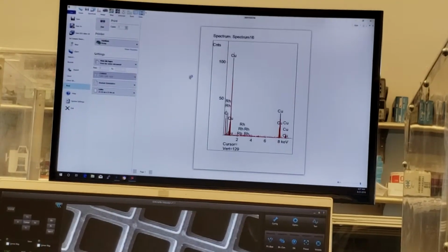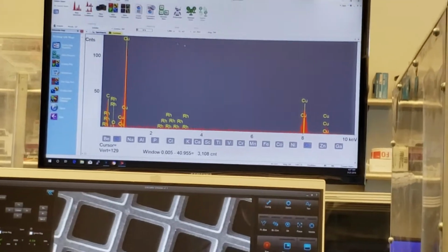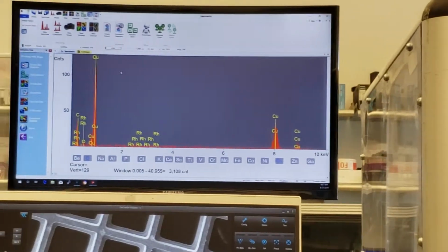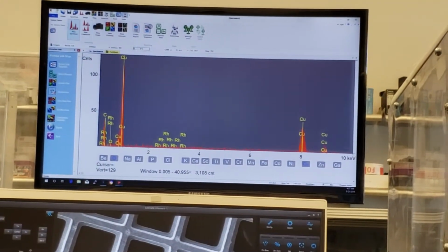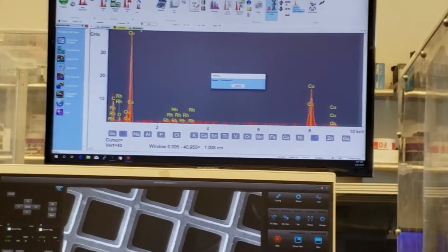and if you were looking at something to print, for instance, like that, there's your print preview of just the Spectra. If you were back at your home again, and if we were to analyze this Spectra, we're in the Spectra window here, so let's go Spectra window, let's go stop. So if we want to analyze, the print preview will look a little bit different.